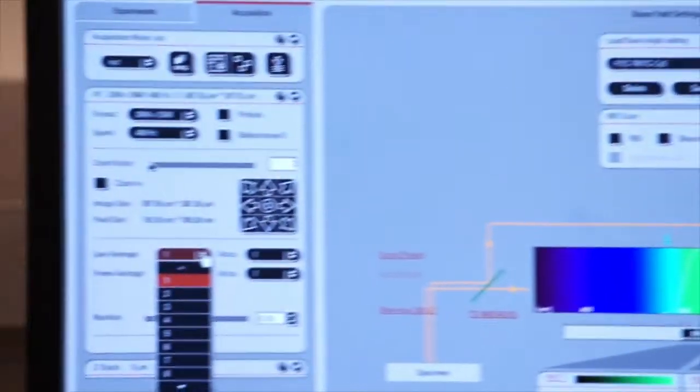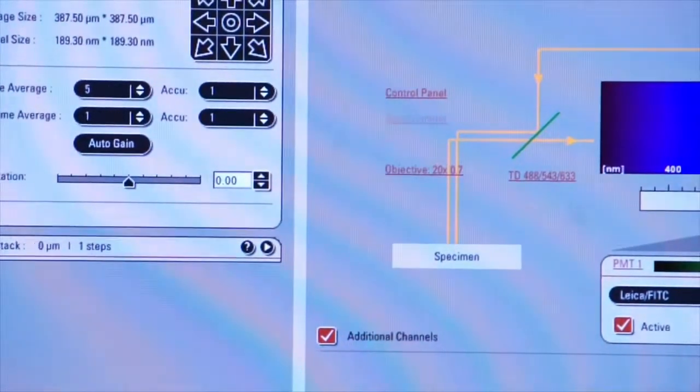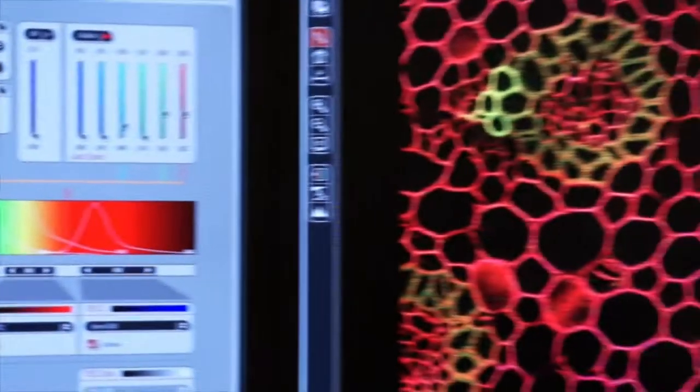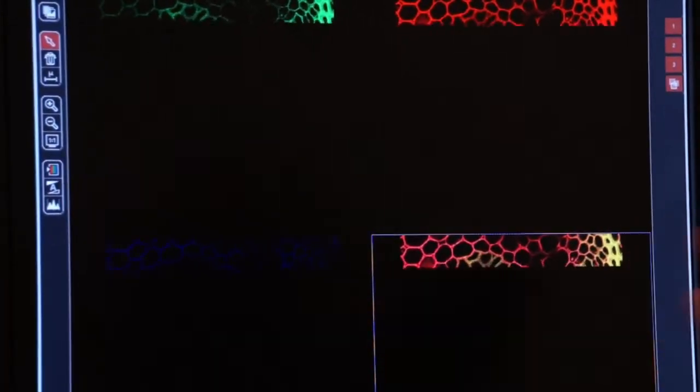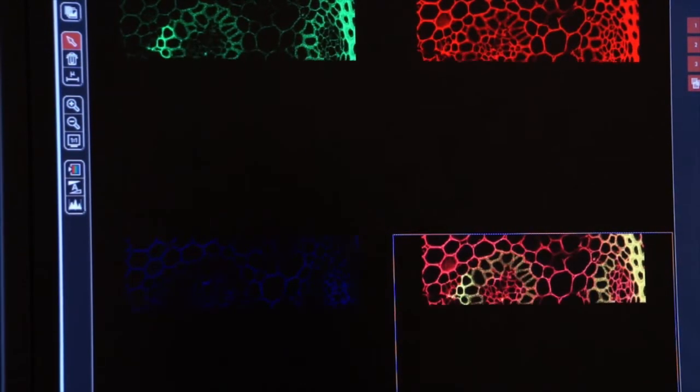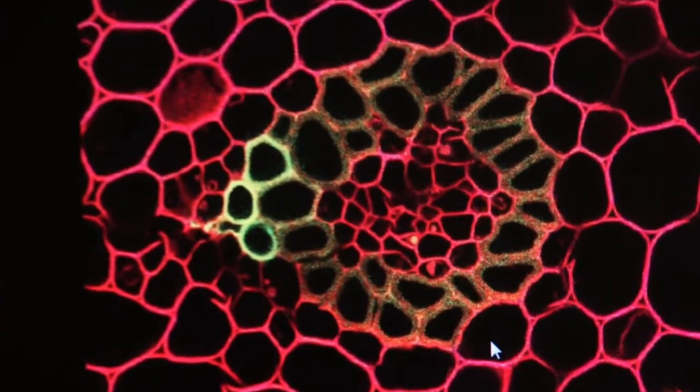So let's go back and engage line averaging. Let's select five scans per line. We'll click on capture image again. Watch the right screen and you'll see our new image come up. Again it's slower. Why? We're scanning each line five times. But when you look at the result in image you'll see that a lot of the noise has gone away and a lot of the pixelation has gone away.